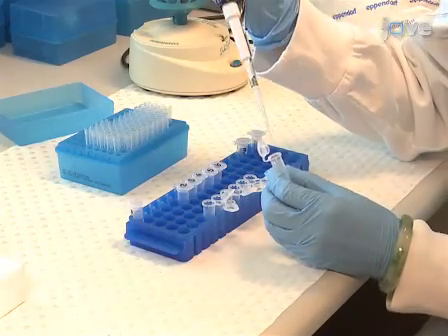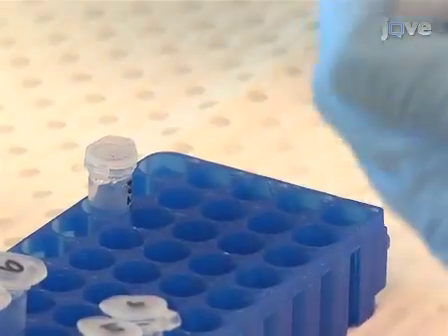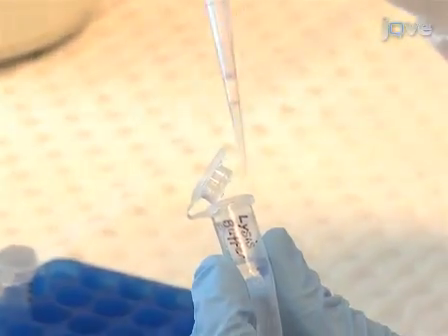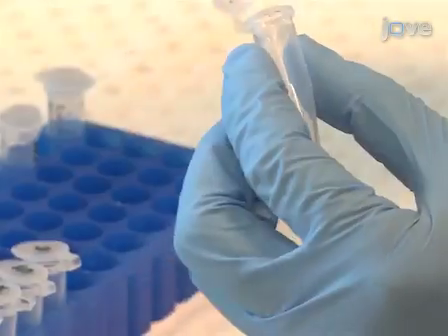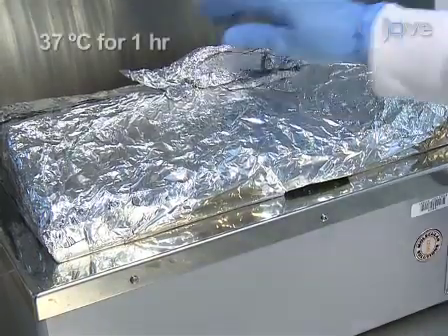To prepare DNA samples for bisulphite conversion, first incubate 2 micrograms of genomic DNA with bisulphite DNA lysis buffer in a total volume of 18 microliters for 1 hour at 37 degrees Celsius.